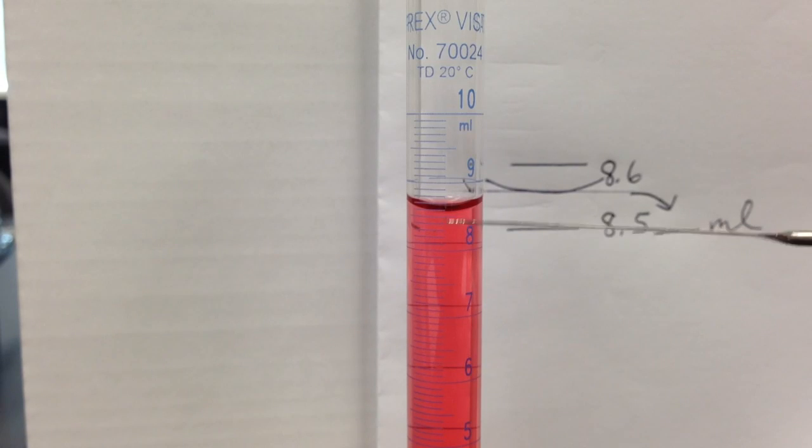As the scientist, as the observer, you need to determine how far between 8.5 and 8.6 the bottom of the meniscus lies. I'm going to estimate it to be 8.56.